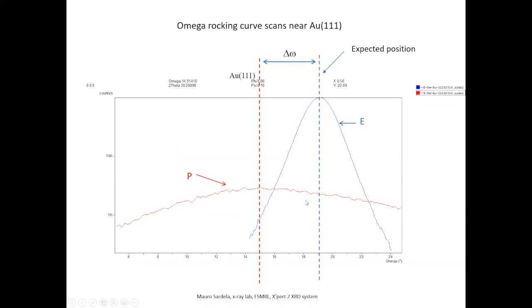For the epitaxial, we scanned this, and they scanned down. You see, much less noisy than what was observed before. We have a happy ending here because you have the substrate peaks, and you have gold 111 and 222, which is consistent with the strong orientation of that sample.